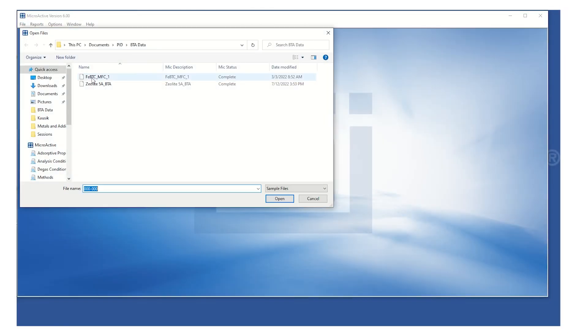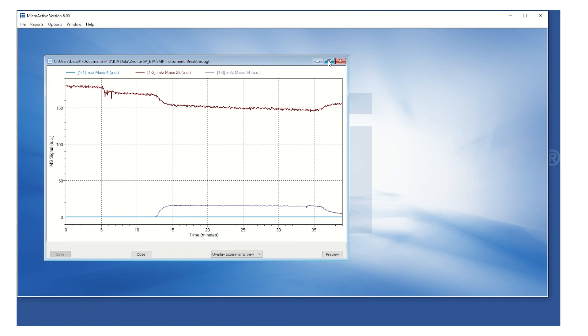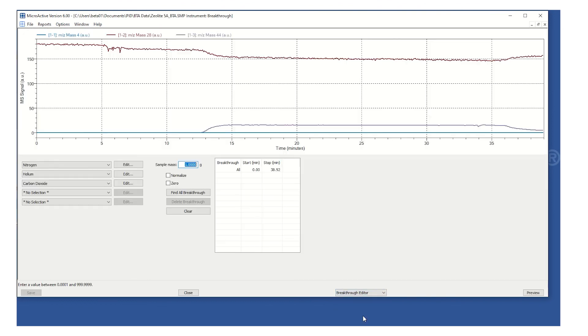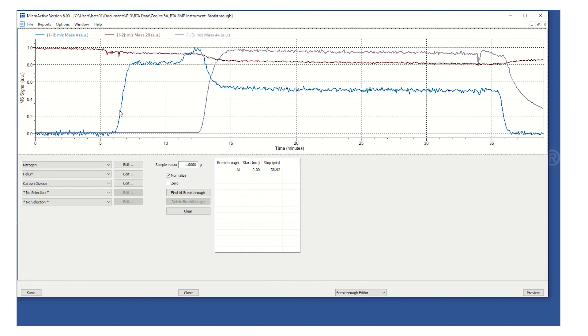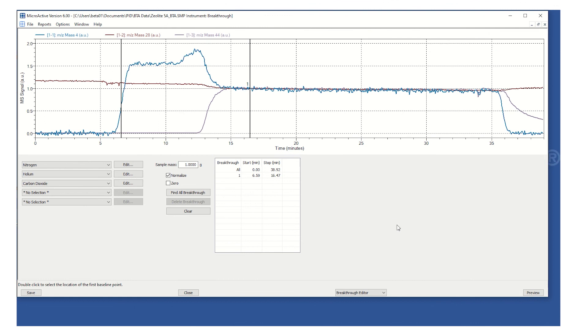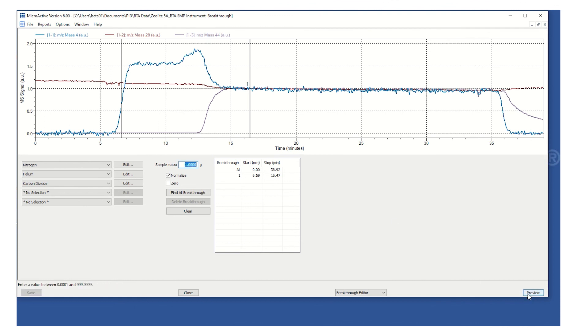After data collection, the data can be analyzed in MicroActive where you can view the combined data from the BTA and the mass spectrometer. This allows users to generate sophisticated breakthrough reports. That is just a quick demonstration on how the BTA can be used to collect a breakthrough measurement in your lab. If you have any additional questions or would like to speak to someone regarding your specific application, fill out the form linked below or reach out to your sales representative.